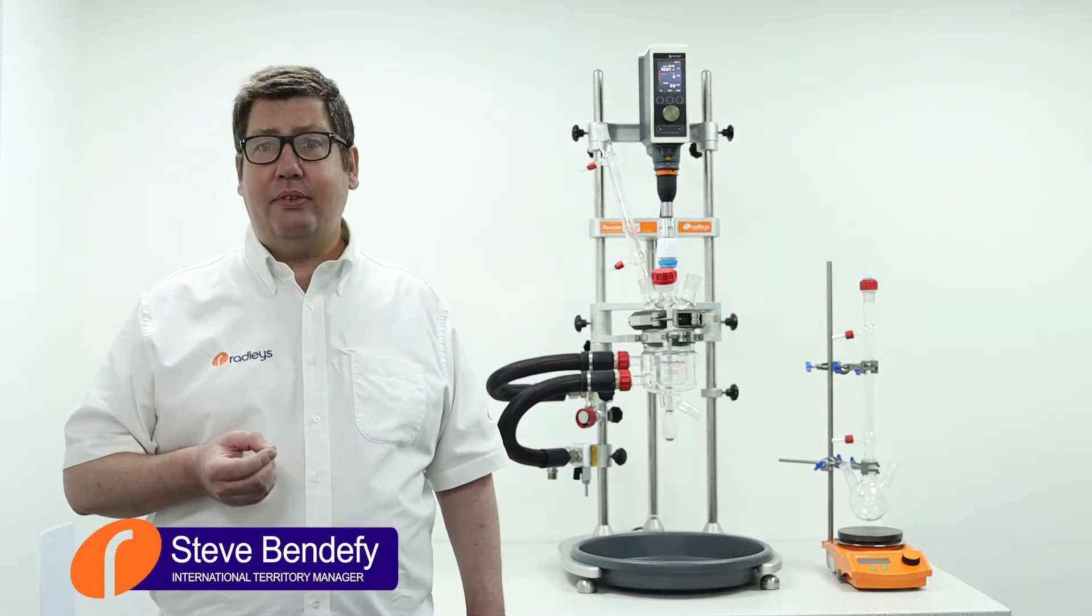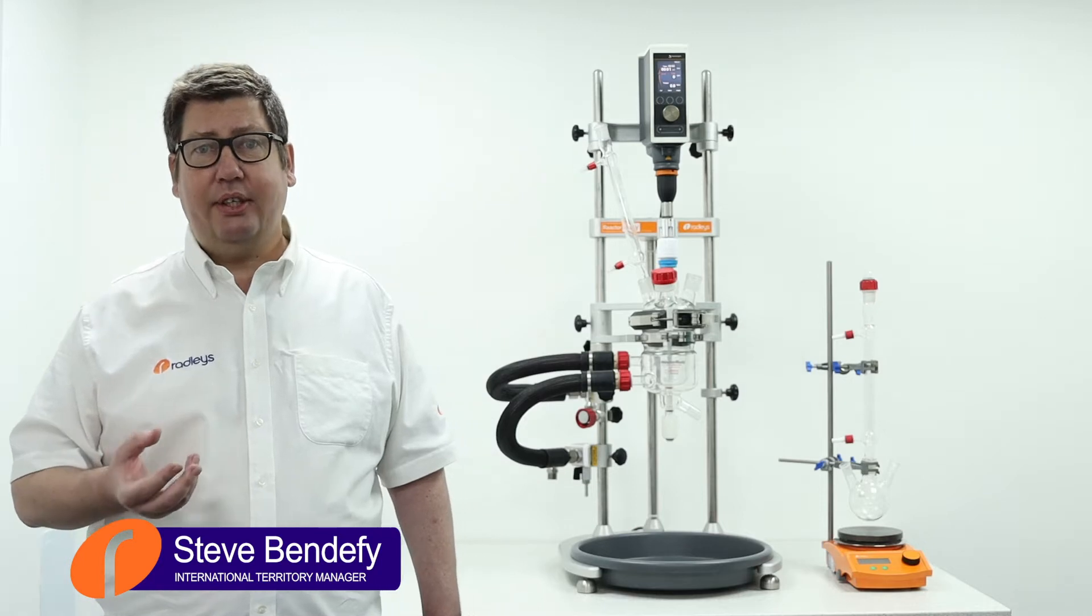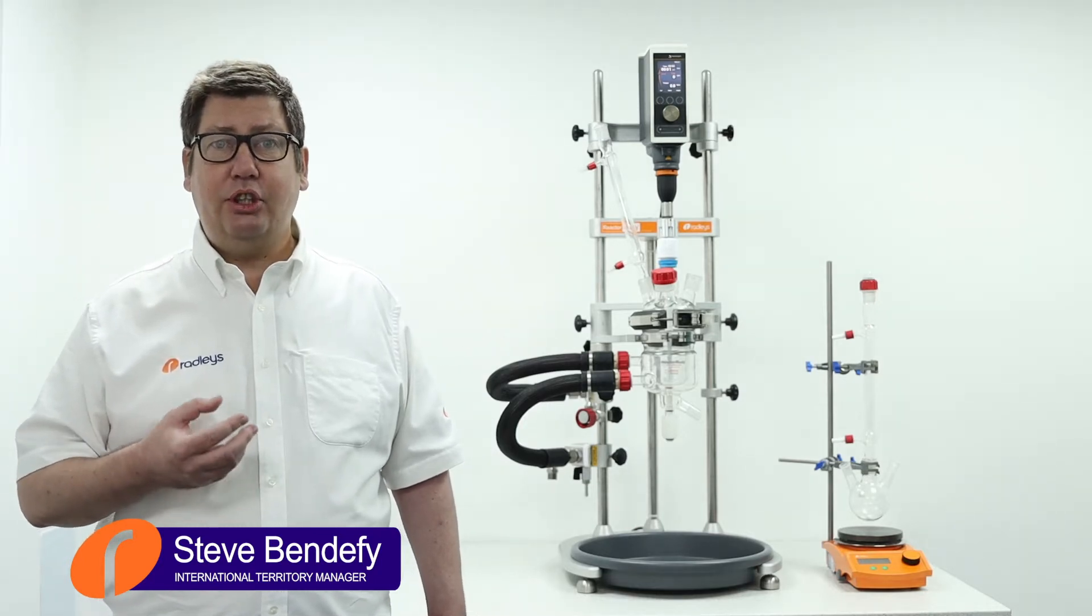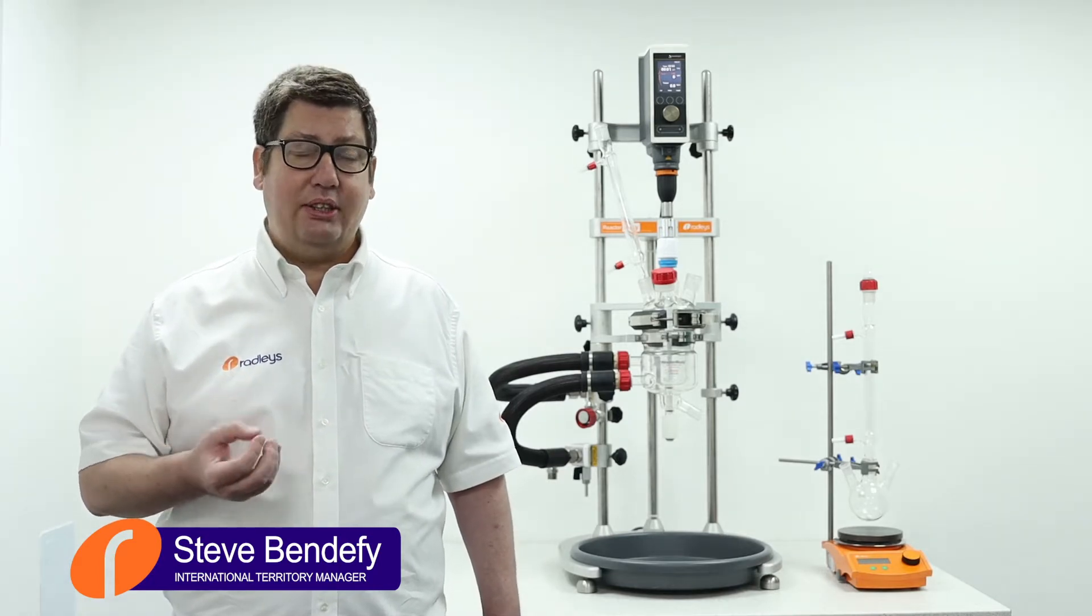Hello, today we're going to look at the benefits of using overhead stirring as opposed to magnetic stirring when carrying out process research and development on a small scale, typically 500 ml sample or less.